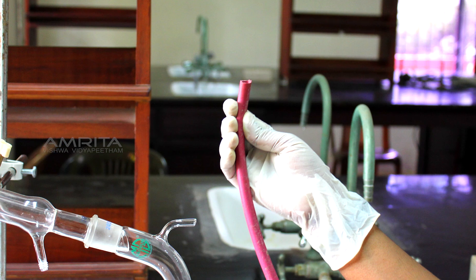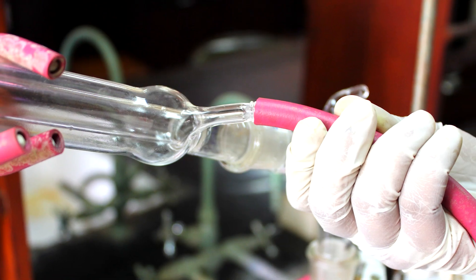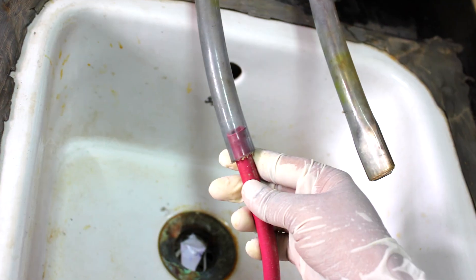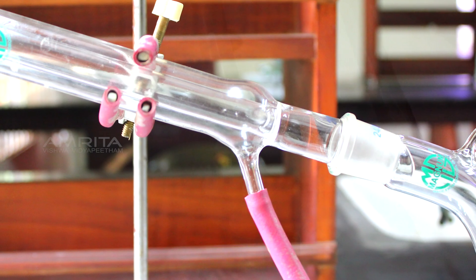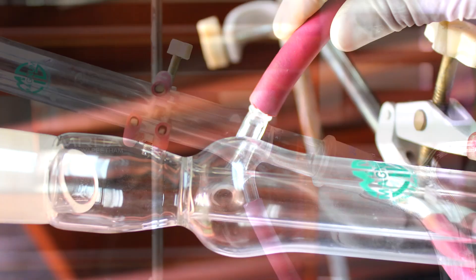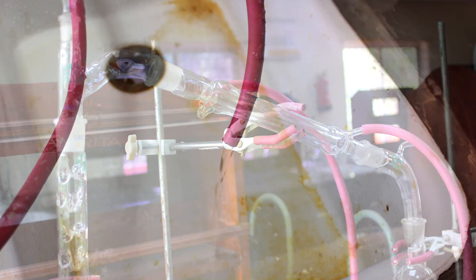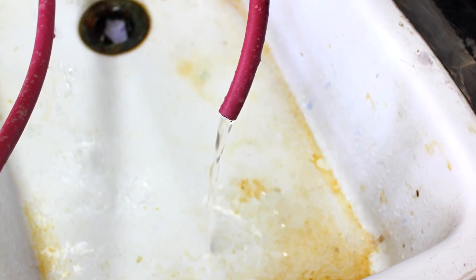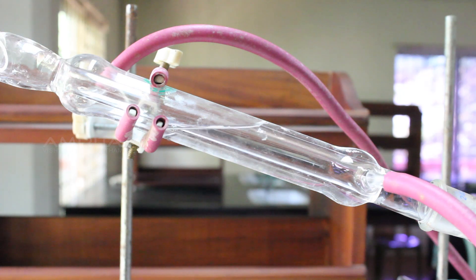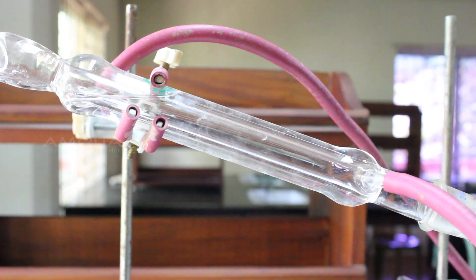Now, connect a rubber tube between the inlet of the condenser and the tap to allow the cold water to enter. Connect another rubber tube to the outlet of the condenser to pour the hot water from the condenser to the sink. Open the tap so that water flows through the tube and fills the condenser and then comes out through the outlet.